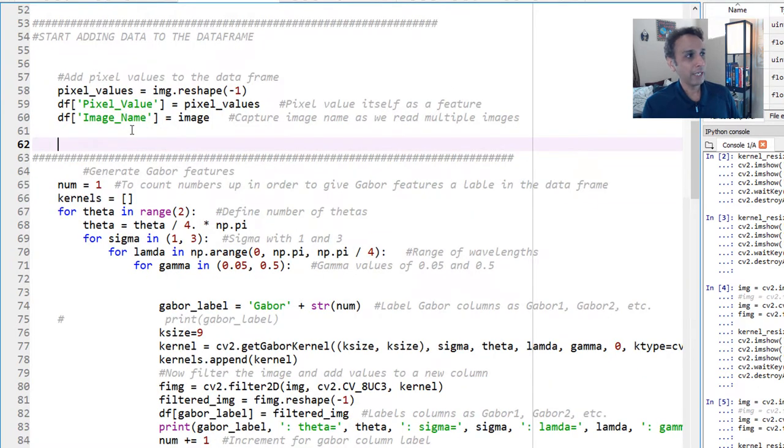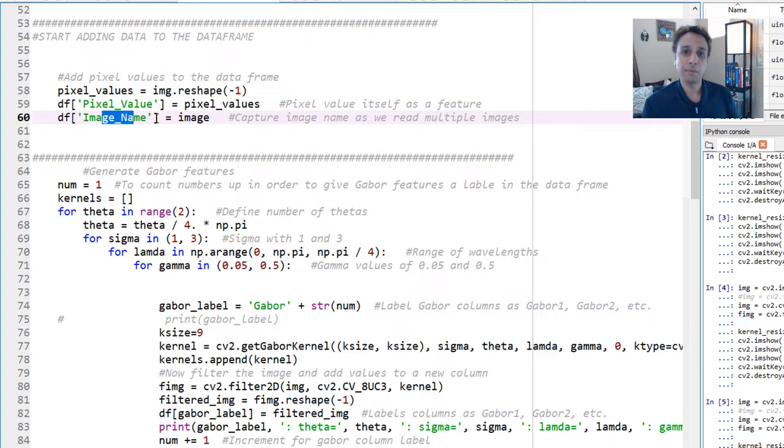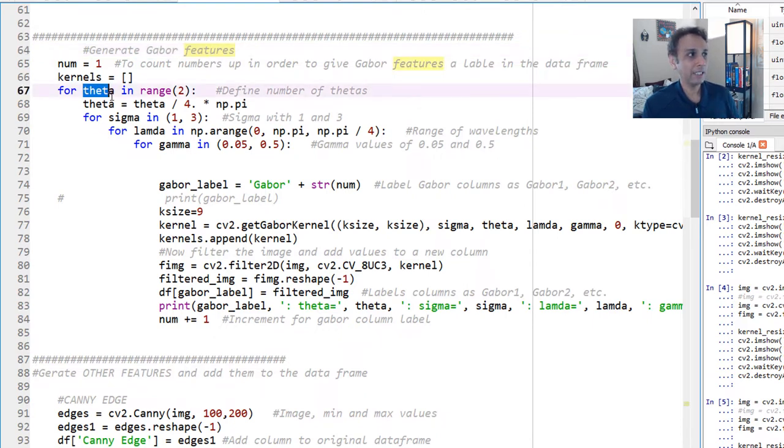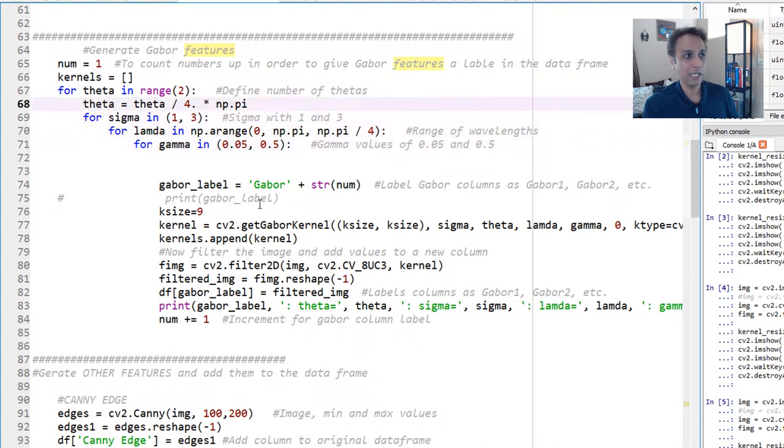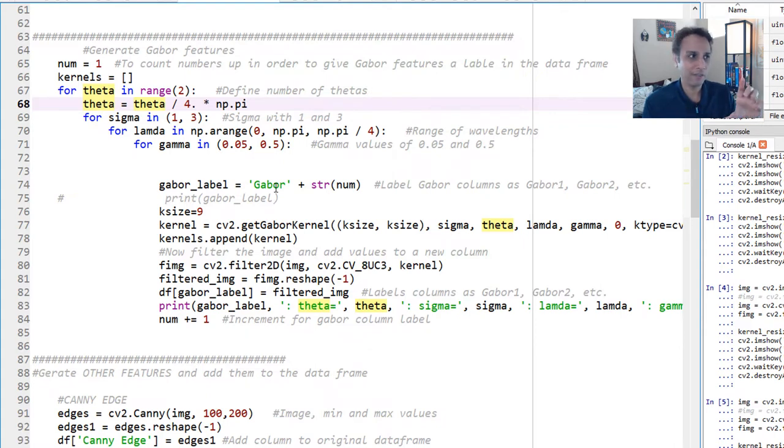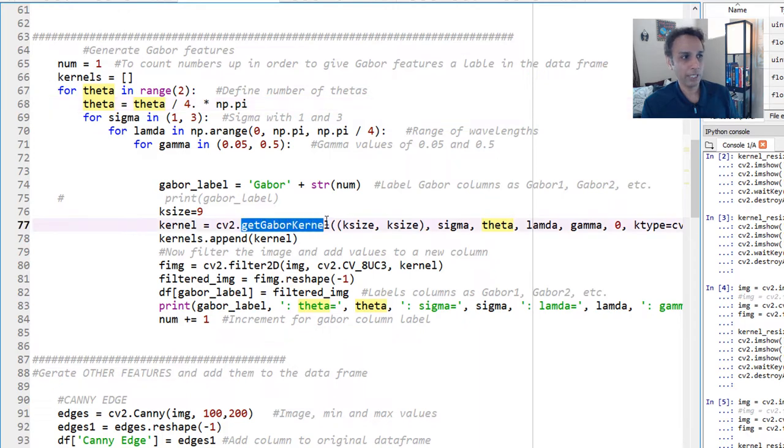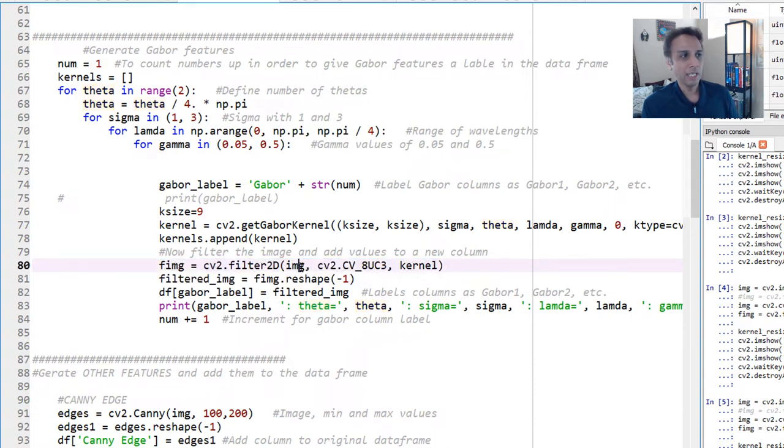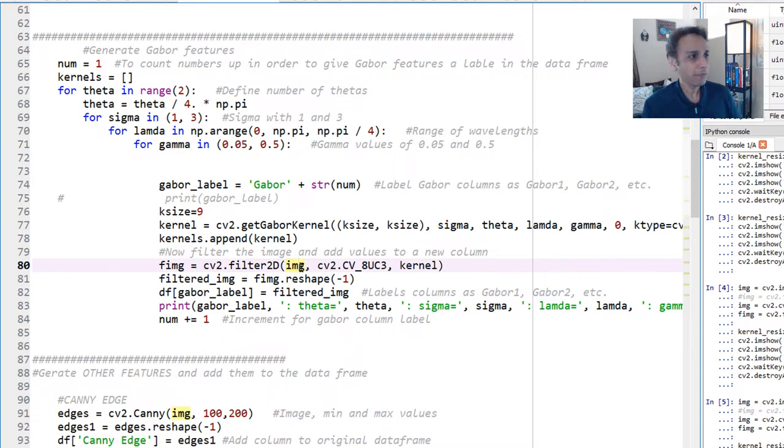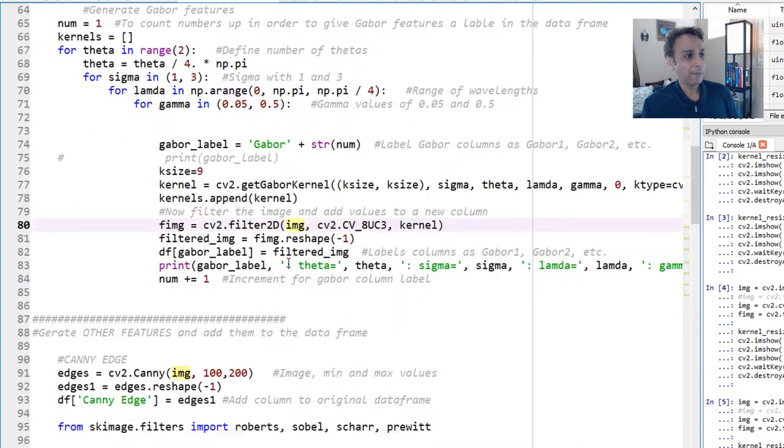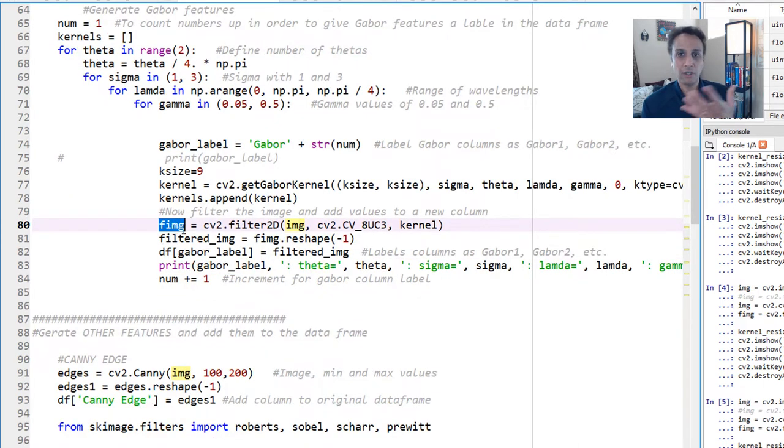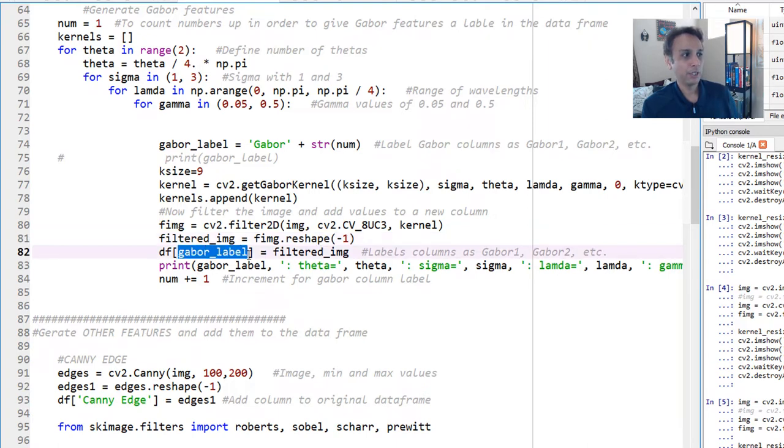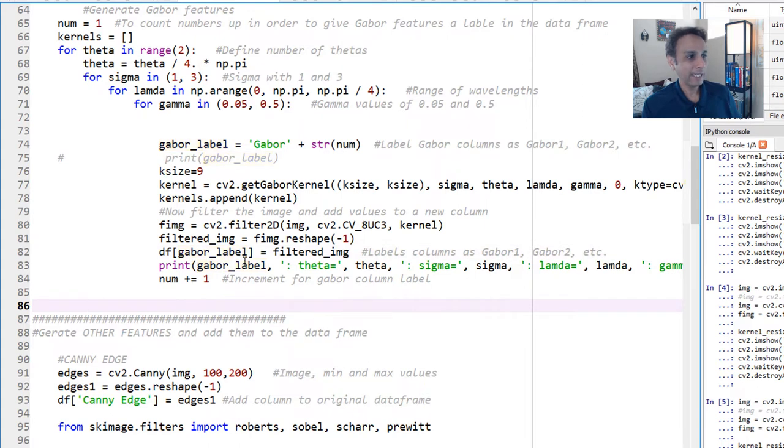Now, we added two features already. Image pixel value is the feature. Next, Gabor features. I just talked about Gabor. But in this case, I'm changing theta. I'm changing sigma. I'm changing lambda. And I'm changing gamma. For each of this, we are going to generate a Gabor kernel, meaning the filter that I showed you earlier, the digital filter. And then apply that digital filter. We are going to get the Gabor kernel and apply that kernel onto our image. Please watch my Gabor video to get more information on this part.